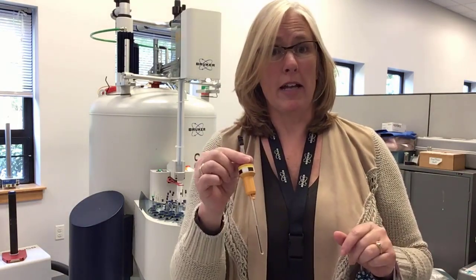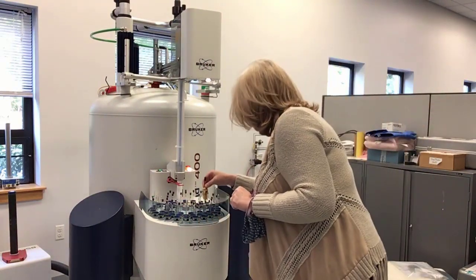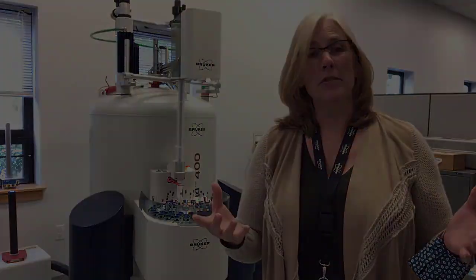In order to set up the AutoCalibrate sample, you take your AutoCalibrate sample, you find a position that is empty on your sample changer, and you remember that number. And that's really all you have to do. Thank you, guys.